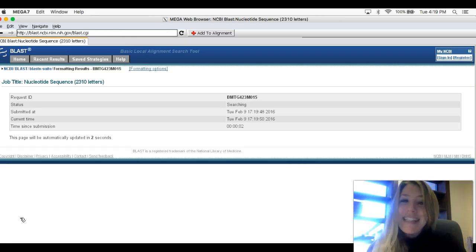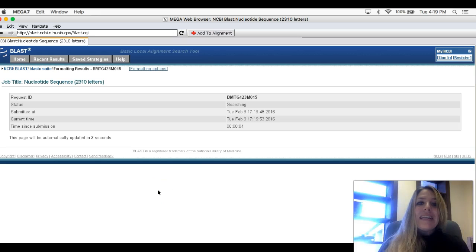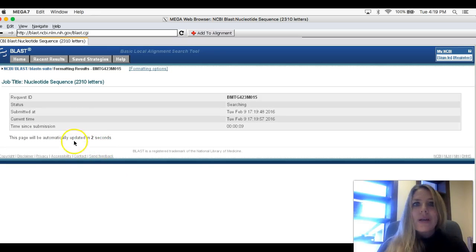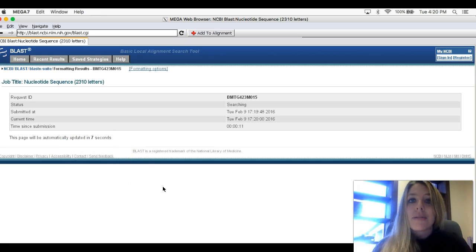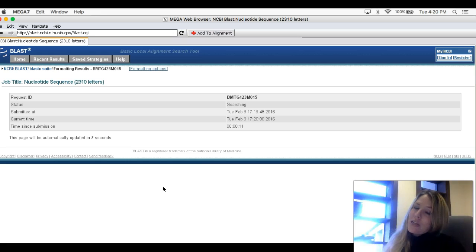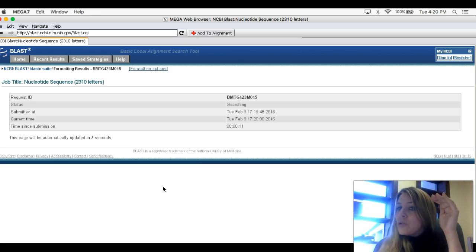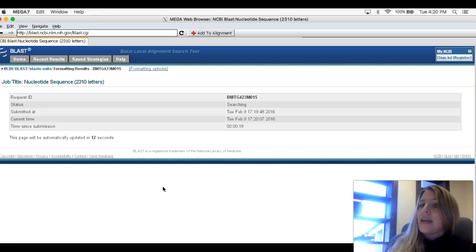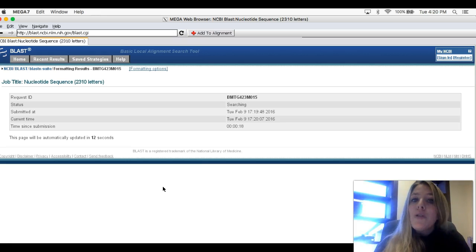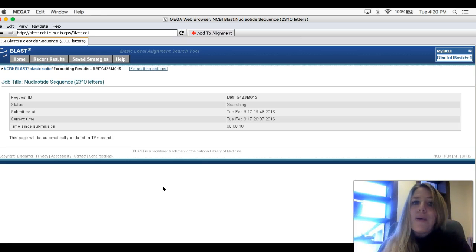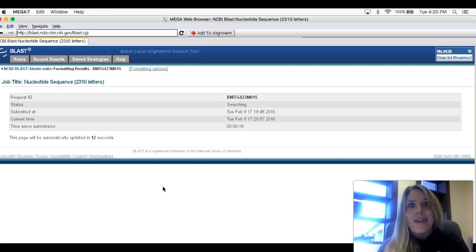Once you've blasted it, it takes you to this website. Now it's going to say it's working. It'll say update in two seconds, seven seconds, 12 seconds. It lies. It's going to take a long time, so you just have to be patient. The more of the sequence you copied, the longer it's going to take. You'll know you're done when you see a bunch of red lines pop up. I'm going to pause the video until mine is done.